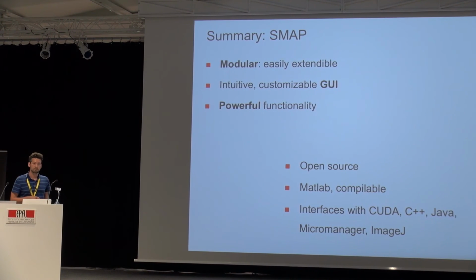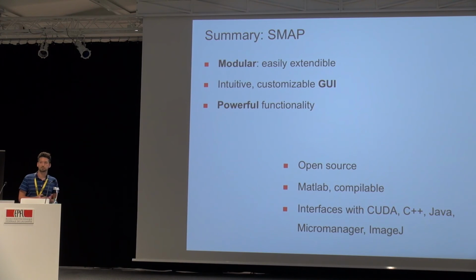It's based on MATLAB. On one hand, this has an advantage because many people know how to program MATLAB and maybe are more likely to provide their own code for this. On the other hand, of course, not all groups have MATLAB, and then one has to use the compiled version. Not everything is MATLAB, though. Some parts are written in CUDA, C++, and Java. So in principle, we can also use plugins written in other languages and on other platforms, and then we have to interface to them. And we interface quite closely with Micromanager and ImageJ.